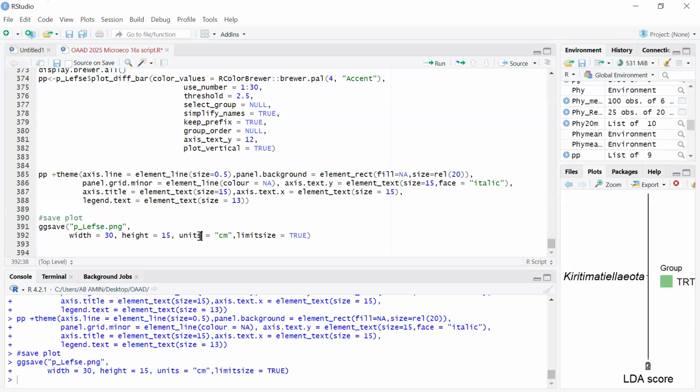If the bacteria we are investigating is different from the ones we have in the database, at what instance do we end up saying maybe it's a new bacteria strain, a novel one, or it's just not in that particular database? At what instance do we get that?